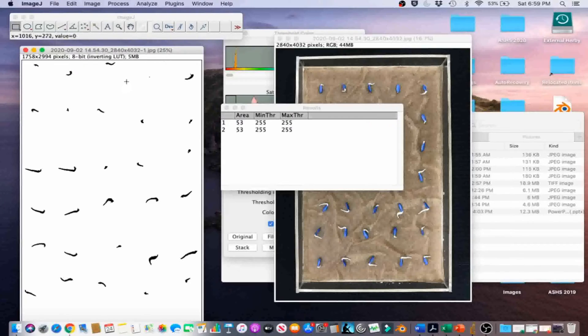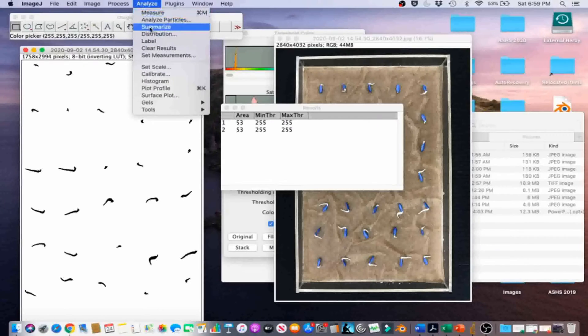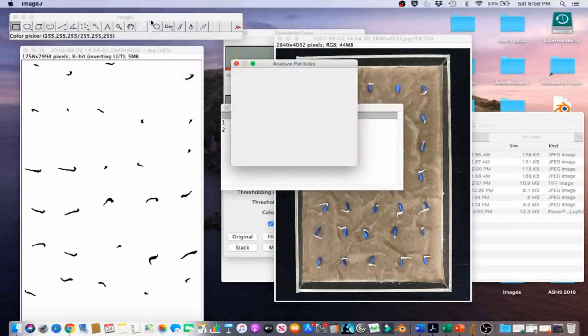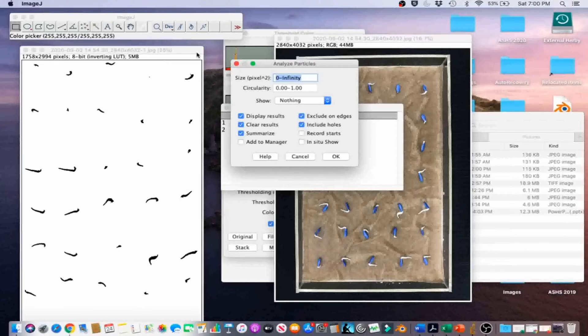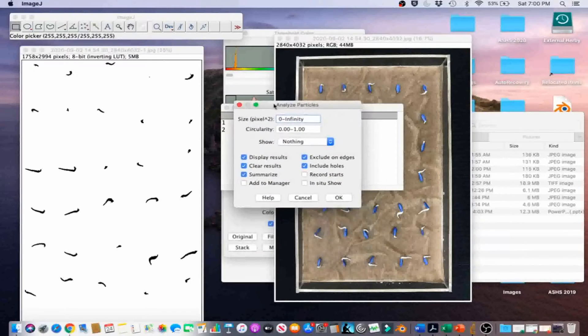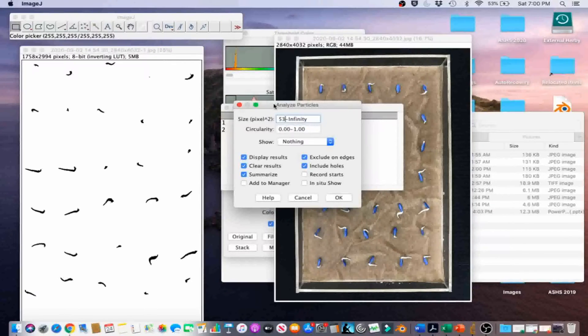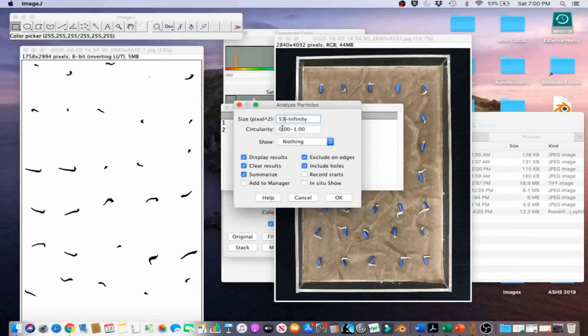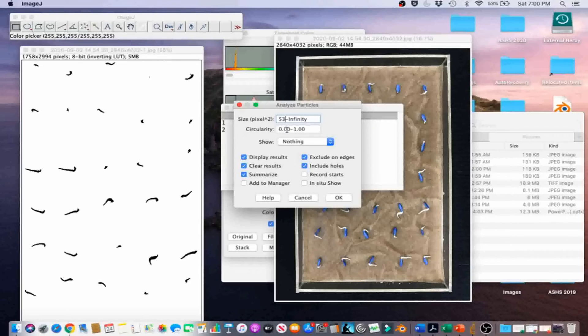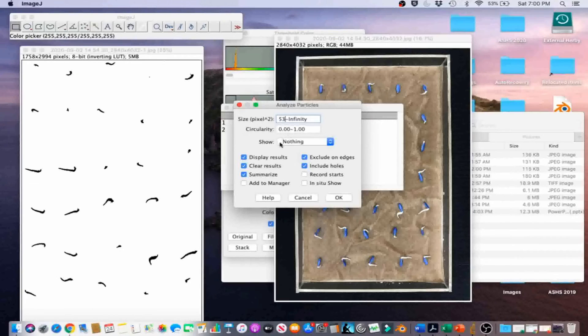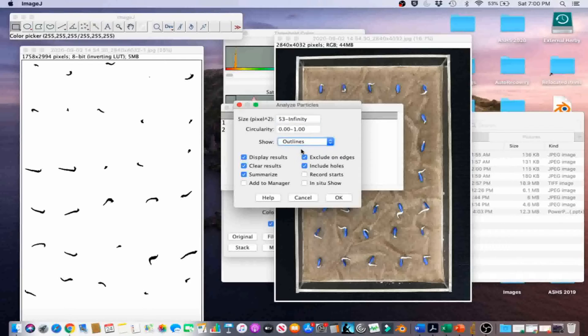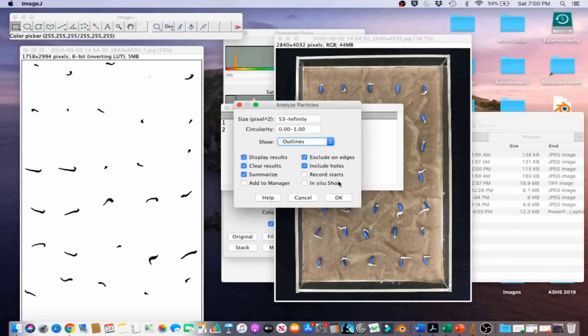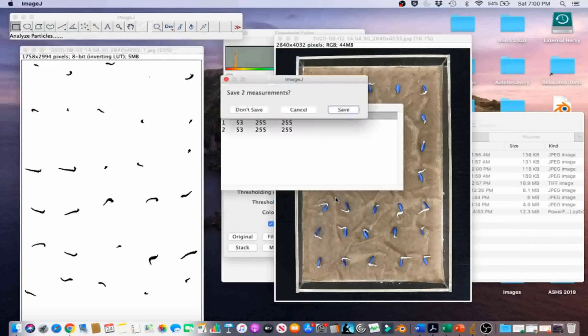Now we're going to go ahead and deselect that. Then we're going to go to Analyze, Analyze Particles, and we're going to count the number of seed with emerged radicals. Since we know the smallest pixel cluster we want is 53 pixel clusters based on the measurement we just made, we're going to go ahead and fill in 53 on the bottom. The Circularity option excludes pixels by roundness by setting the minimum and maximum circularity. 0 is not round at all, and 1 is a perfect circle. We're going to leave the Circularity default setting, which is the complete range. In the Show option, we're going to choose the Outlines option, because it creates a visual output which assigns a visible number to each pixel cluster for easy identification. Now we're going to go ahead and click OK.